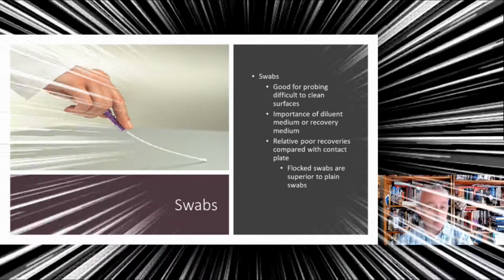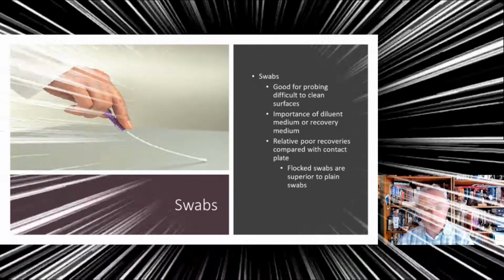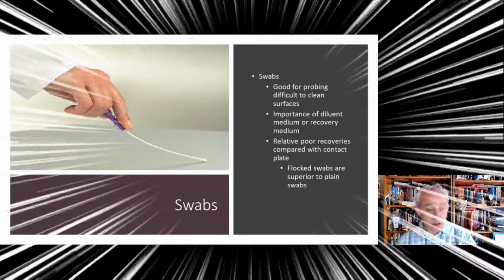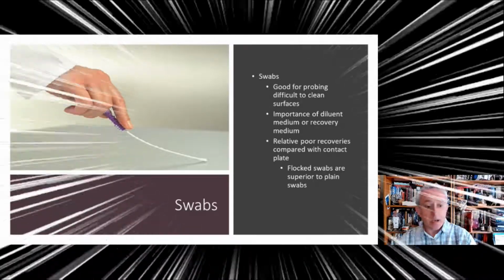So we get between 40 to 60% recovery rate with flock swabs, as demonstrated in studies. And there's a lot of reliance with swabs on the technique. Okay, so that was an introduction to environmental monitoring techniques and to some of the weaknesses with those.